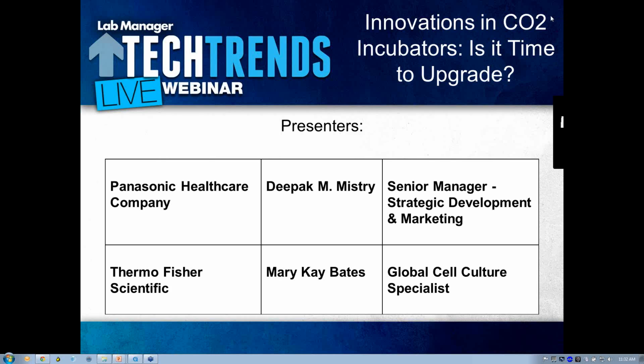Hello everyone, and welcome to Lab Manager's Tech Trends webinar series. I'm Tanuja Kopal, contributing editor for Lab Manager, and I will be moderating today's discussion on innovations in CO2 incubators and their uses in cell culture. We are joined today by two technical experts from Panasonic Healthcare and from Thermo Scientific, and they will be talking about some of the new features for CO2 incubators and the factors that you should be considering if you're in the market to either buy or upgrade your incubator.